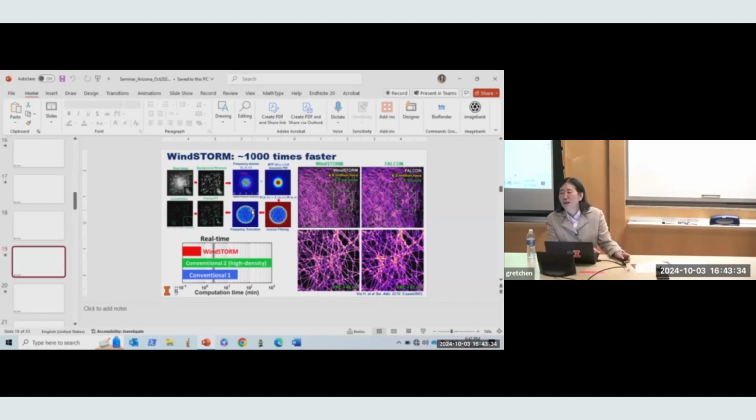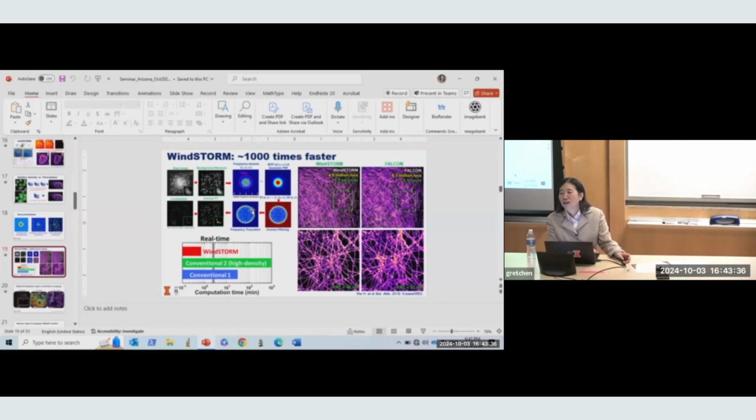Have you ever explored using chromatic confocal microscopy to look at the depth, or does that not work with super resolution imaging? So people use spinning disk confocal to capture the blinking events. That works. I think the trade-off is you need a certain time to accumulate.